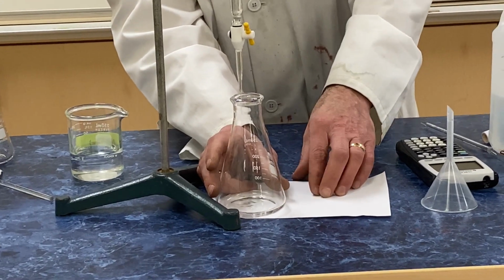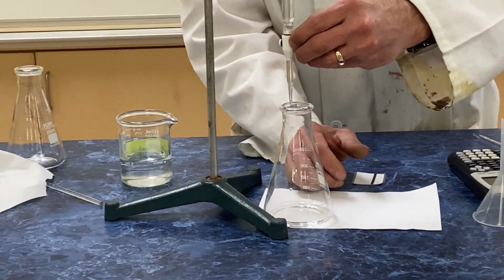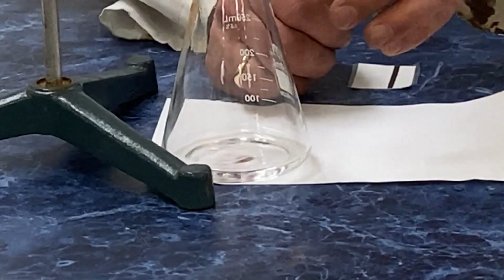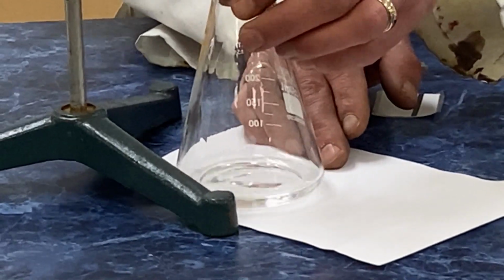Oh, that looks like we're getting close there already. Getting down to 8. So when you get closer to the required volume, you slow the titration down to about 1 to 2 drops per second. No, I'm wrong. It's more than 11. Well, you're not. You're still in the ballpark. Oh, we're still there? Okay.